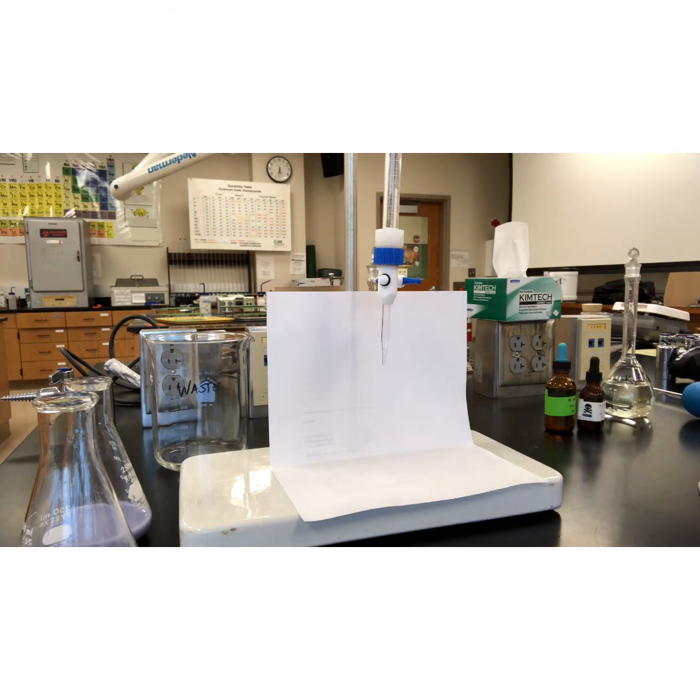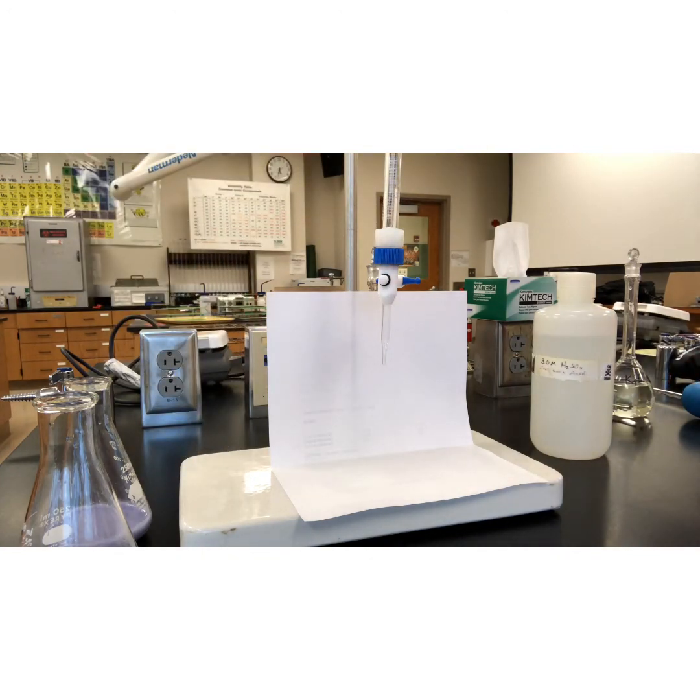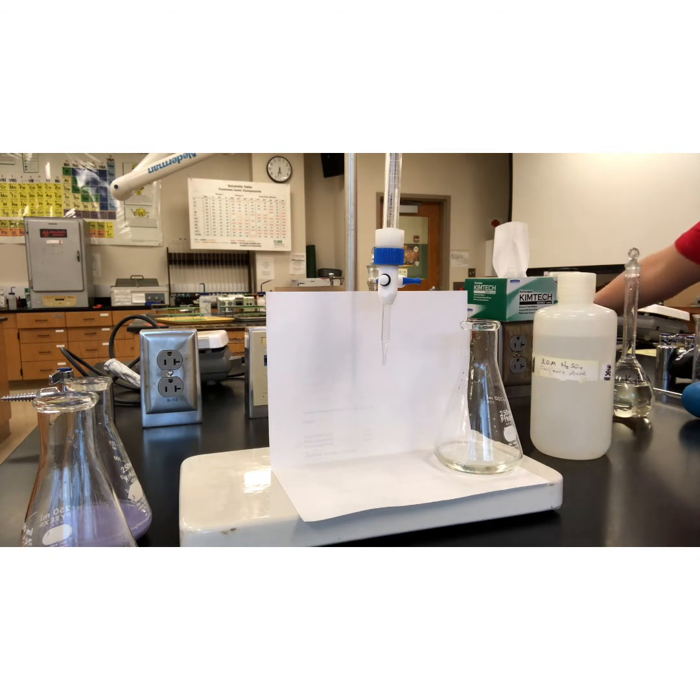5 milliliters. Oop, that was way more. I'll pour them out into my waste container. That's not way more than like 2 milliliters. Okay. On the counter. I'll go ahead and clean that up. Just gotta stick my elbow in it. That would have been cool. Quite warm actually.